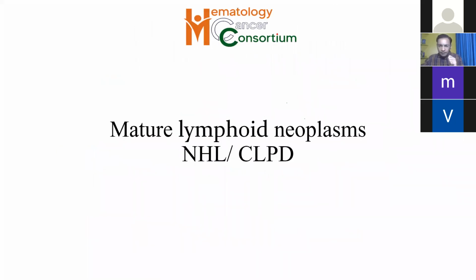Now, I don't know whether I should go for the lymphoid population because I have crossed 1 hour already. I would ask Dr. Manju if I should continue, because it will take 15 more minutes, or I can skip these slides and go to the conclusion. I think, Prashant. Sorry, go ahead, Manju. Go ahead, Vikram. I think we can go ahead for a little while. It's going very nicely, Prashant. Yeah, sure. So another 10, 12 minutes should be fine. Okay, so I'll move.